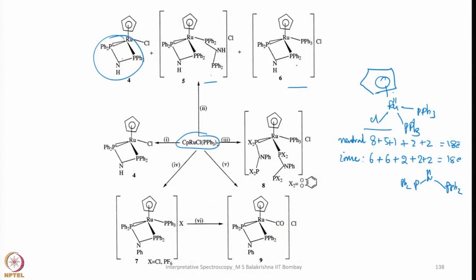Very interesting. And also, how did we come to a conclusion about the spectrum, analyzing this particular set of multiplets for this molecule? Of course, when we carried out separate reactions and isolated the compounds, we could confirm. In some cases it's very simple, as in this case. You should get a doublet and a triplet here, and in this case you get a singlet, so there is no scope for any confusion. But if there is scope for confusion, with a similar pattern for 2 or more molecules, then we have to separately make them and confirm their chemical shifts.